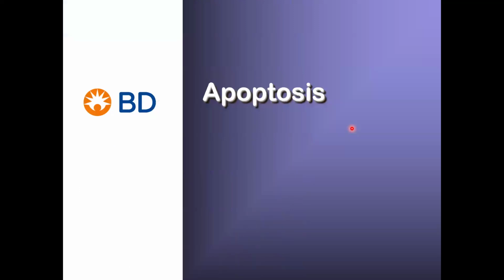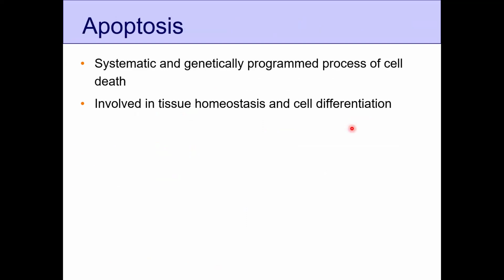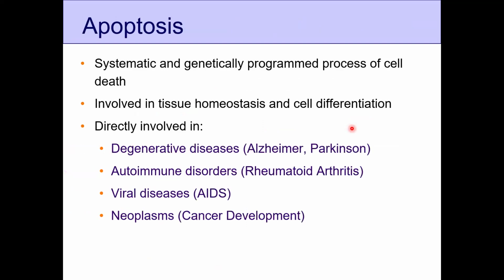Now comes the apoptosis part. You can do apoptosis analysis using a flow cytometer. How can you do that? You might know apoptosis is a vast topic for research. People do a lot of research in apoptosis because I would say in every chronic and acute disease, there is cell death happening.